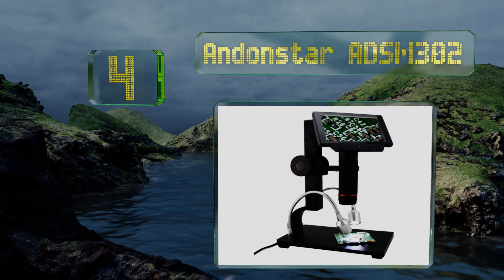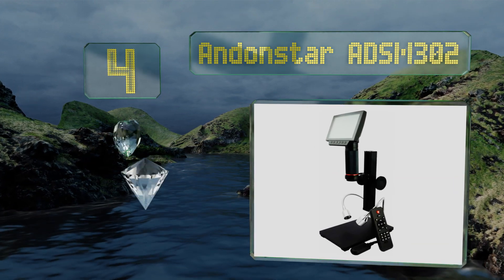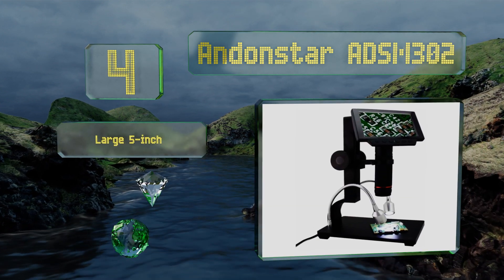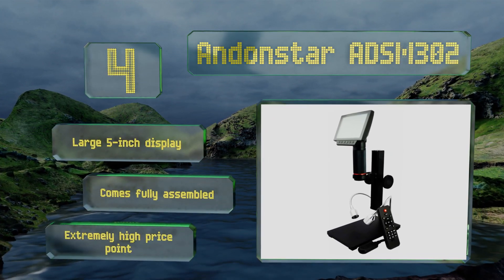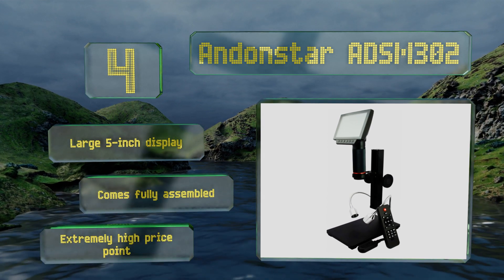At number four, the Andon Star ADS M302 syncs to your computer for a handy way to measure specimens, and you can also connect it to an HDMI monitor or TV for viewing. The remote control allows you to change magnification and brightness without touching the body. It's equipped with a large five inch display and comes fully assembled, however the price is extremely high.